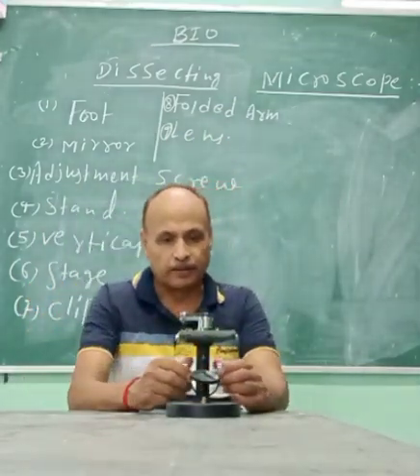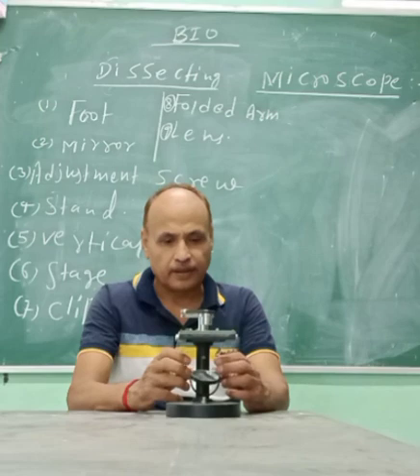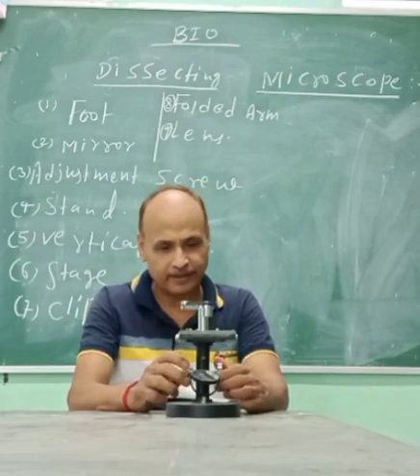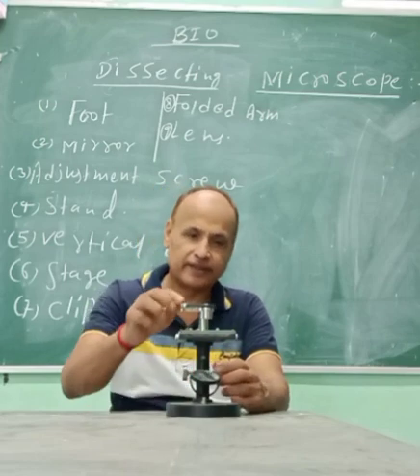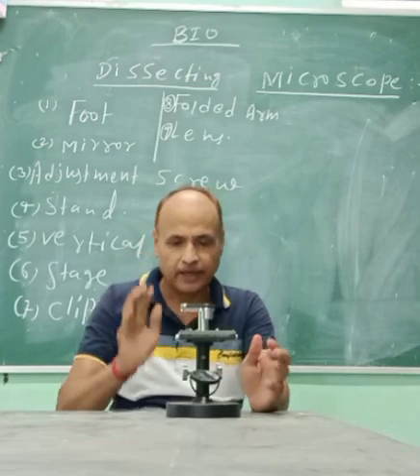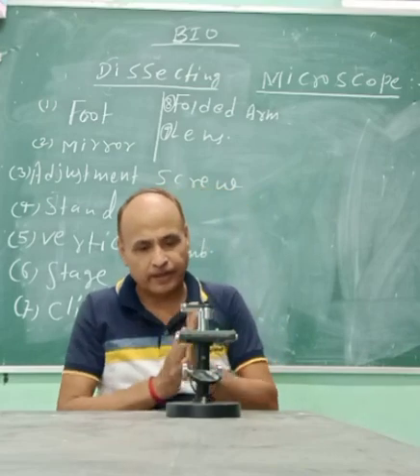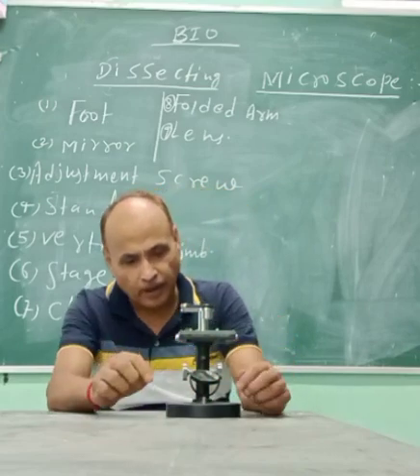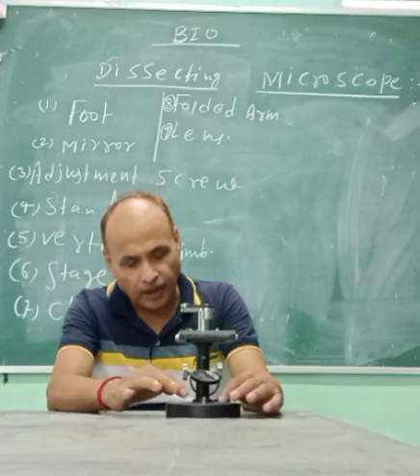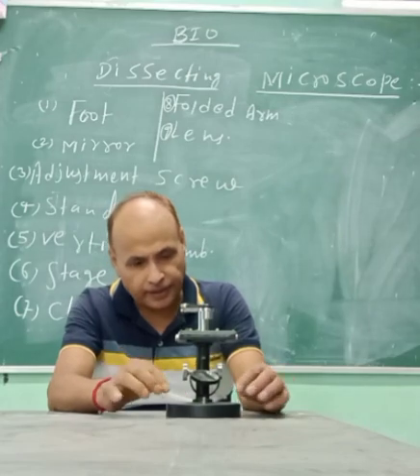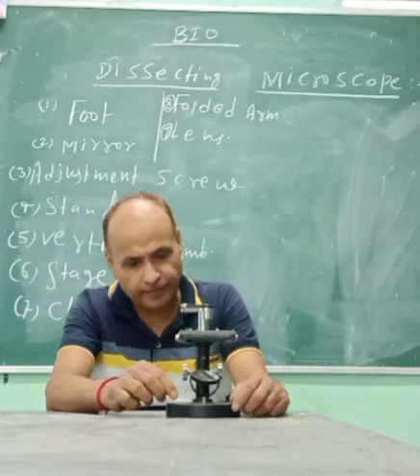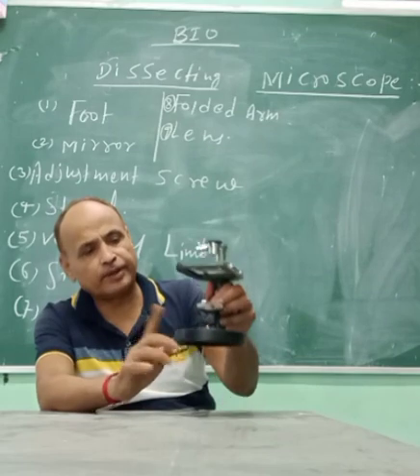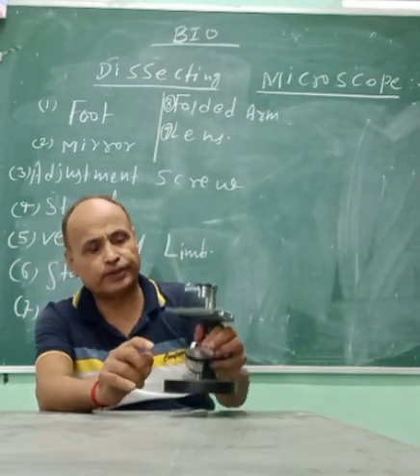You are observing the Dissecting Microscope. First of all, we have to study its different parts. The first part you see is the foot.